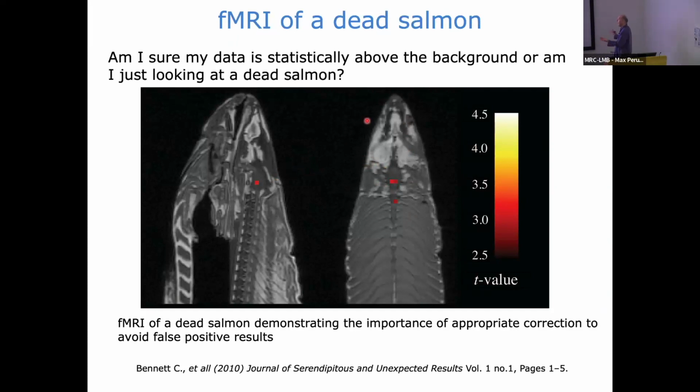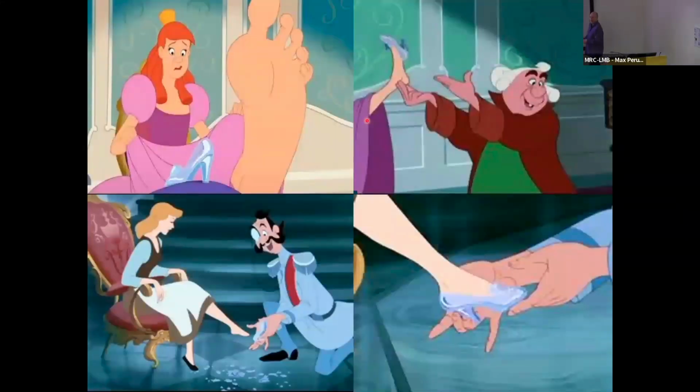So this is really showing you that in this kind of field, the real problem was in the data processing, and actually it could give rise to lots of false positives. So what we hope is that we're going to have some lovely data, and we're going to have some lovely mathematical models. We're going to put the two together, and they're going to fit very, very nicely, like here. And your prizes will come one day, kind of publications.